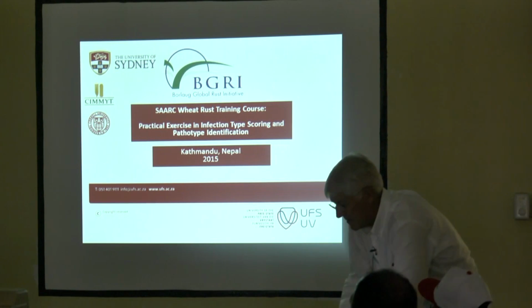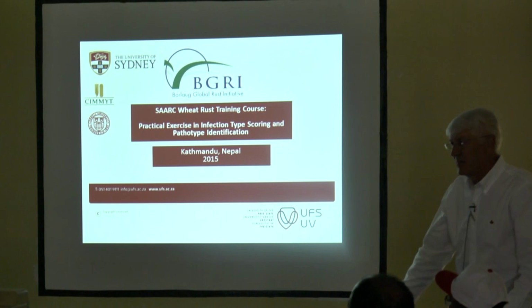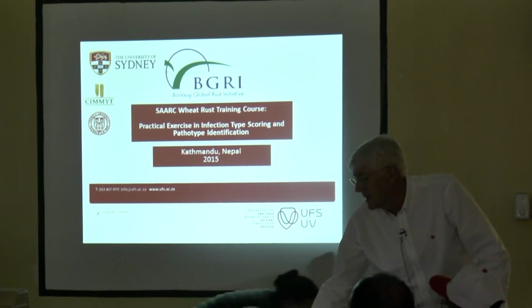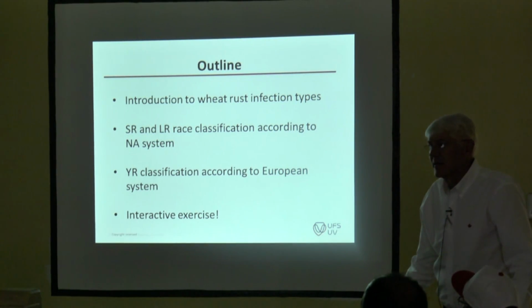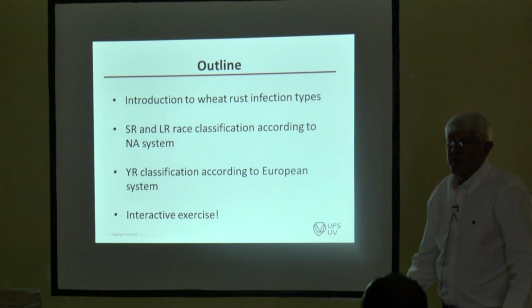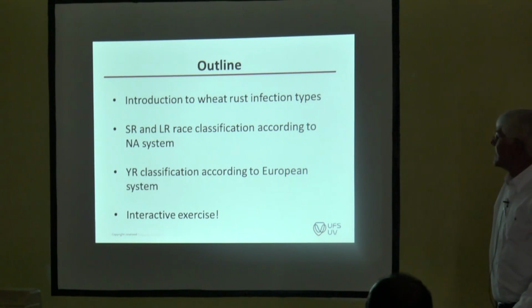Right, so today we're going to talk about, firstly, seedling infection types and using that information in pathotype classification. And then secondly, I will be showing some pictures and some background on adult plants and phenotyping in the field and in the greenhouse.